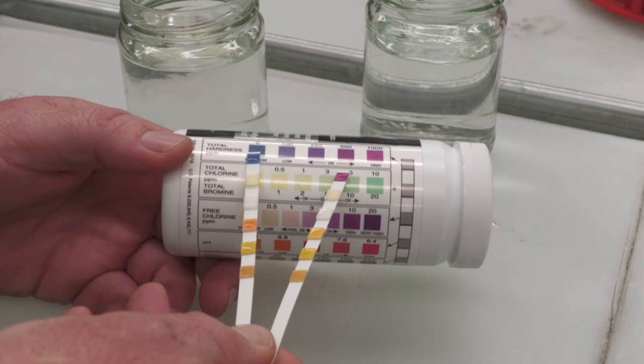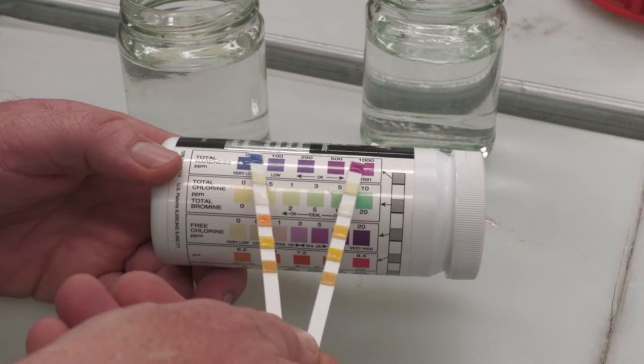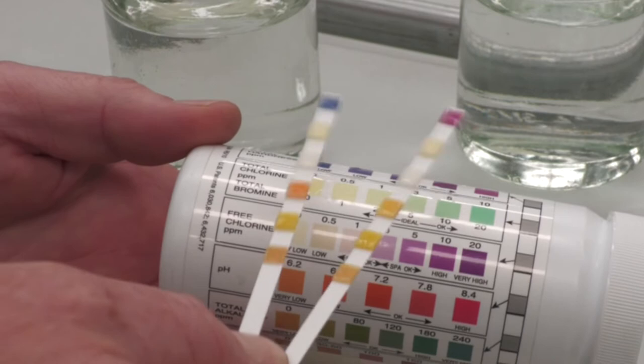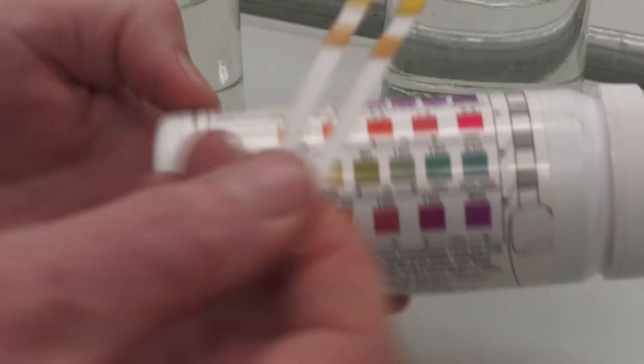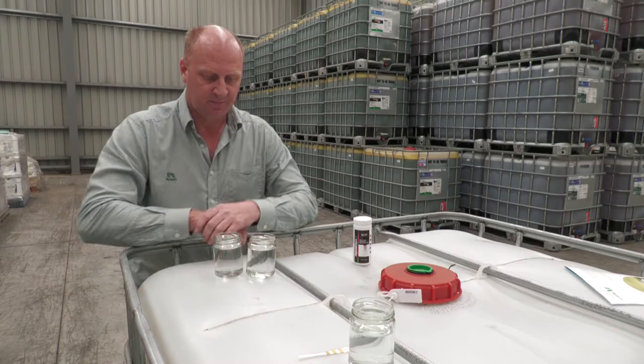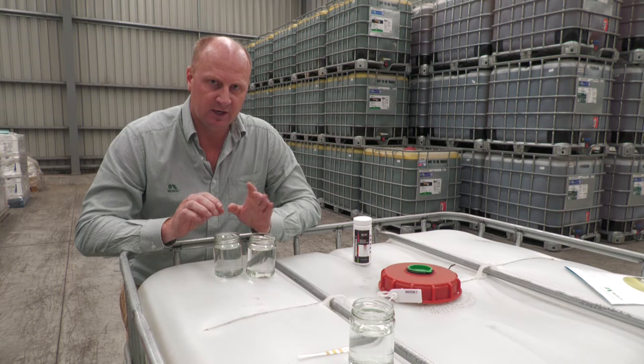These pool test strips are really good at looking at total hardness. You can see the rainwater there was very low, and when you match up the hard water on the right, you see it comes in at about a thousand parts per million. Obviously we don't have chlorine in the rainwater so it's very low. Another parameter we're looking for here is the pH, and both of these are quite low — the pH is about six.